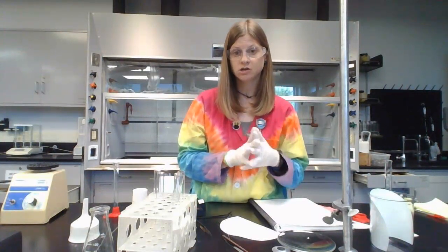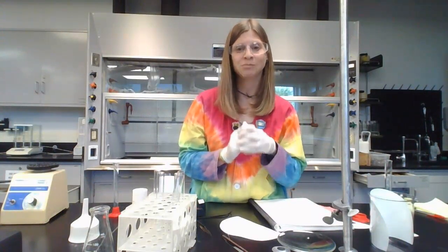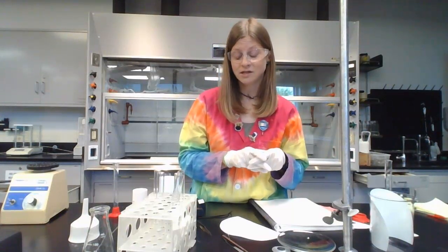Don't forget to read the safety data sheets and complete the safety questions for this. You're not allowed to do the lab unless you've done that. Watch the other video for the background theory and calculations for this lab.